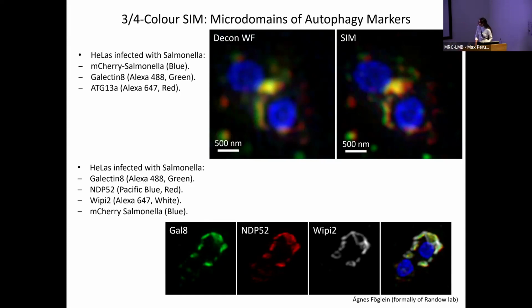You have here, yes, those are cells infected with salmonella, and you can see that there are some structures that surround them.